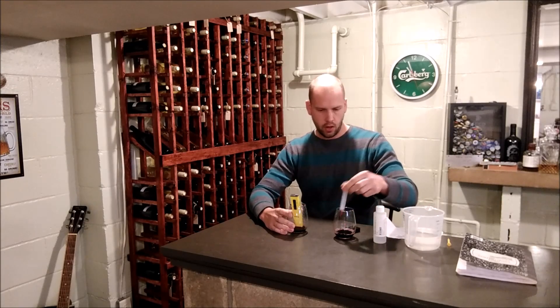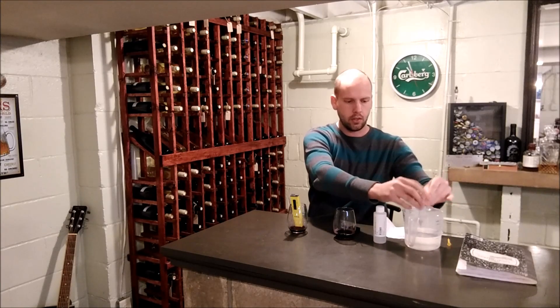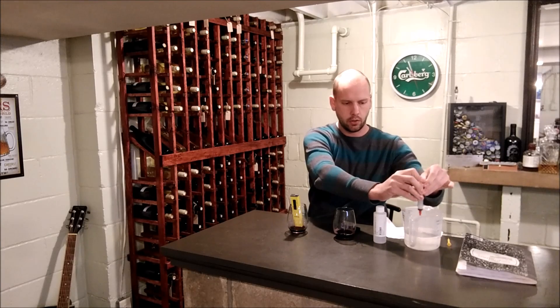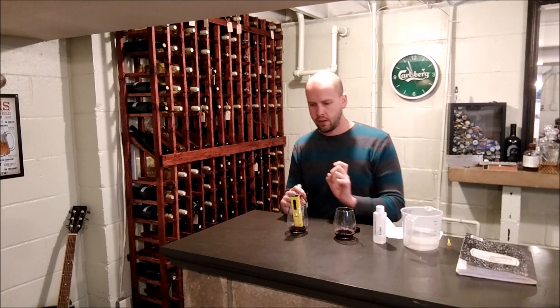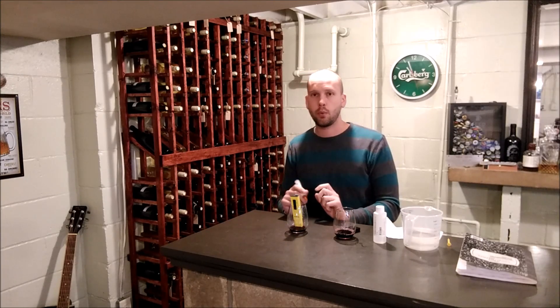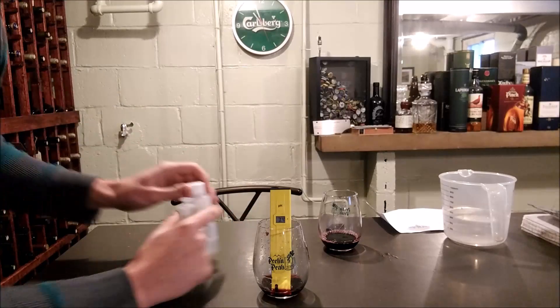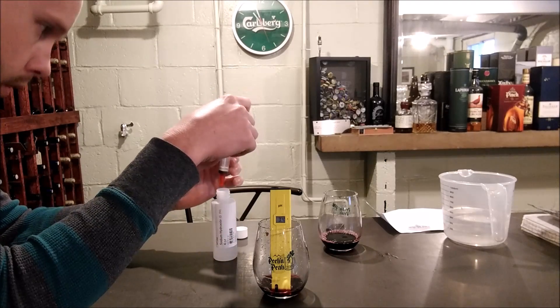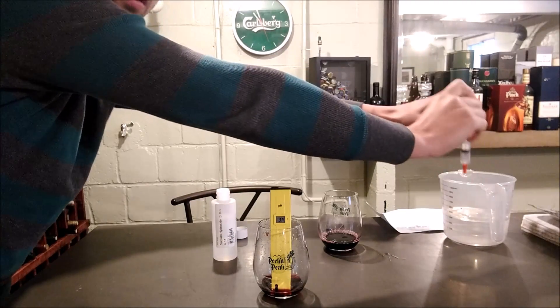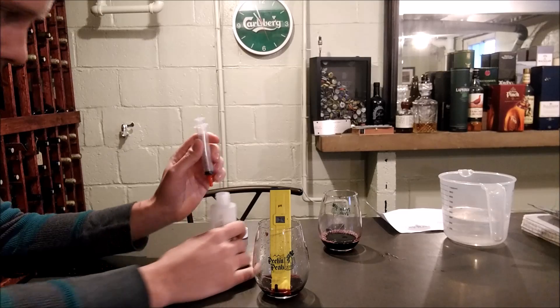The next step is to neutralize the sample — essentially the same process as the indicator color-change method, but we're using a pH meter because it's more accurate. I've calibrated the pH meter with a 7.0 buffer solution, which you want to do before starting. The pH of the wine sample reads 3.4, and now I want to add our 0.1N sodium hydroxide.